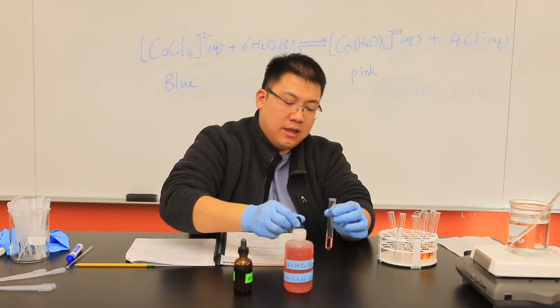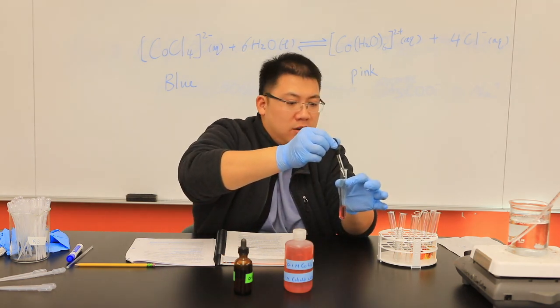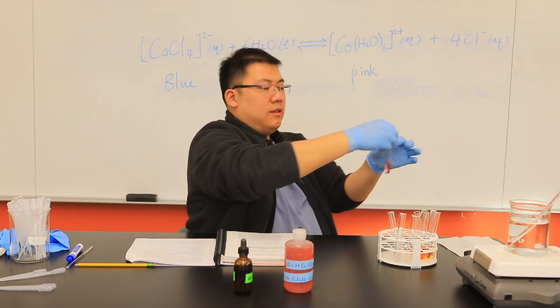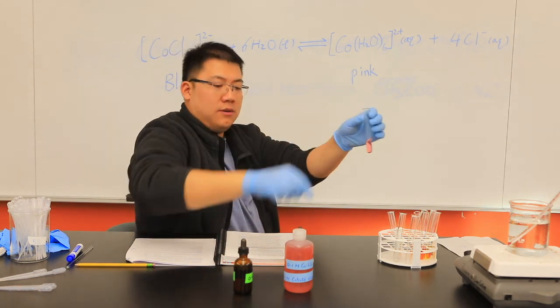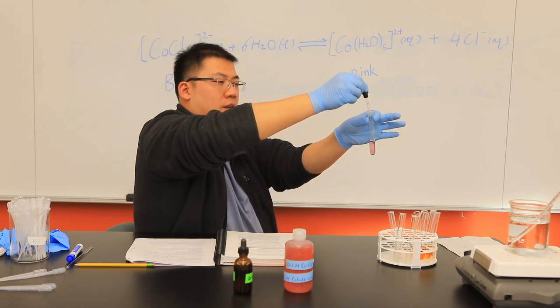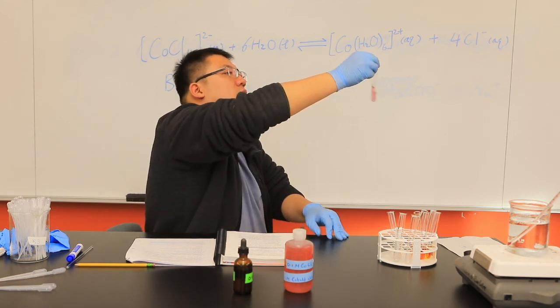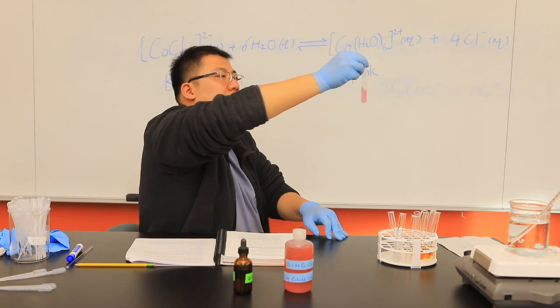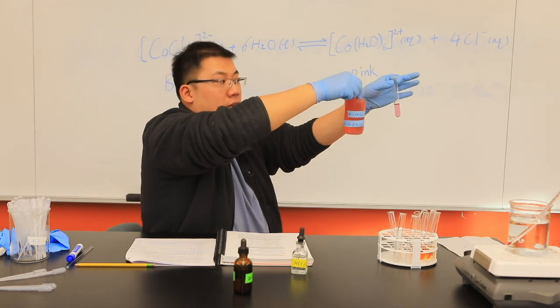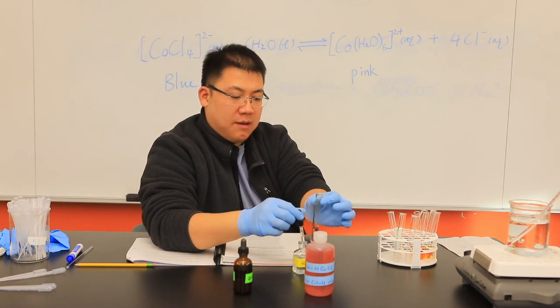Okay. Even before I finish this little demo, you should expect to see what color. That's really strong. Okay. Some of you may start to see the color change. It's not as pink as before. It's more on the purple side, right? What happens if I keep adding?